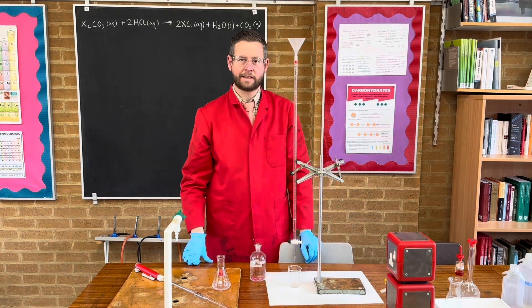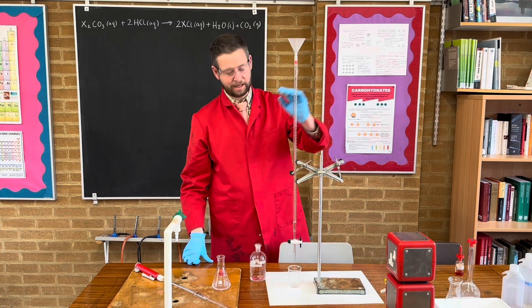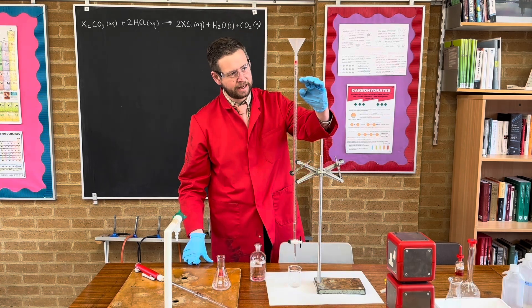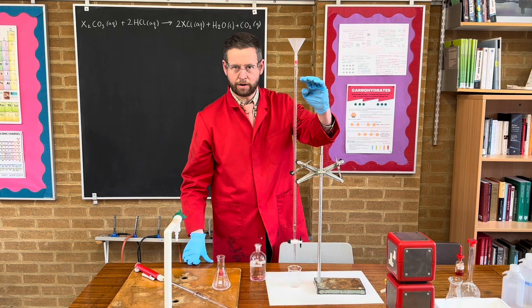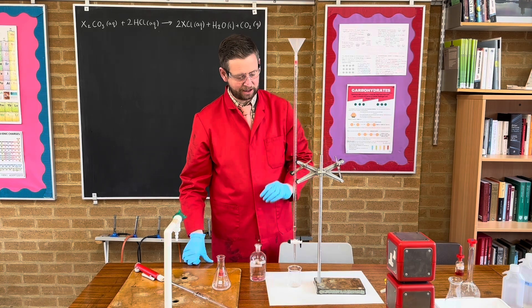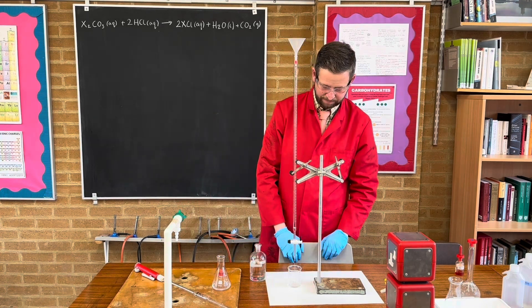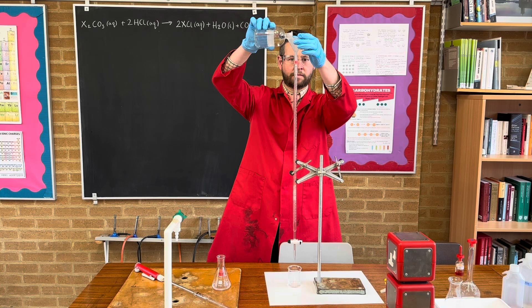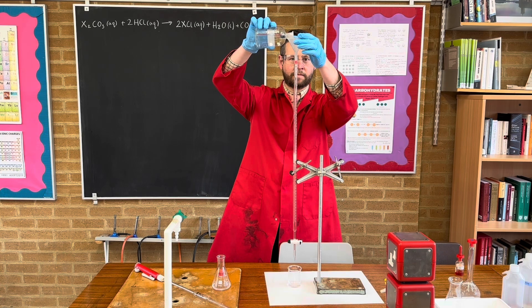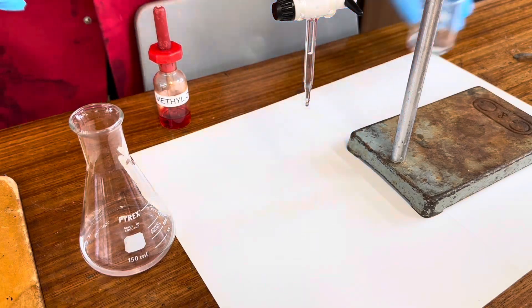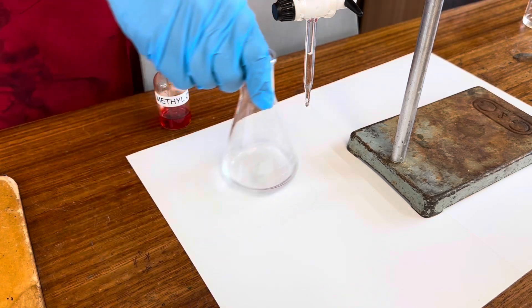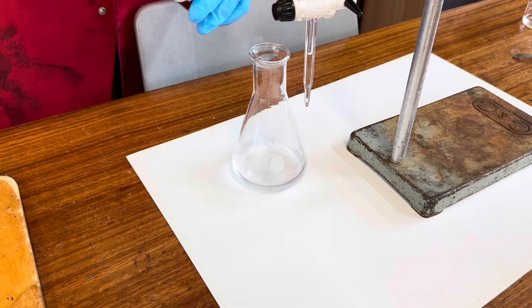Once it has flushed through, we're then going to measure out an amount of this 0.1 molar hydrochloric acid. It needs to be below the zero point on here so that we can measure the change in volume. So now we shall remove this, and here is our analyte.